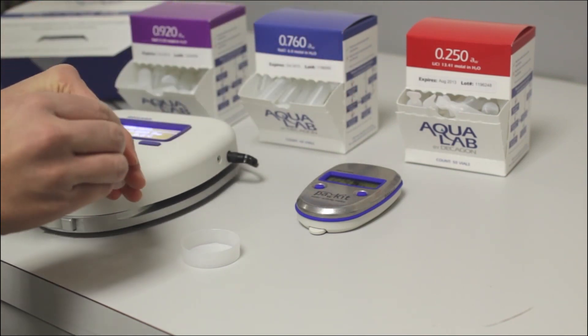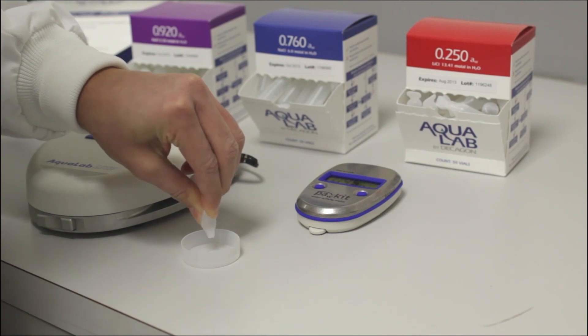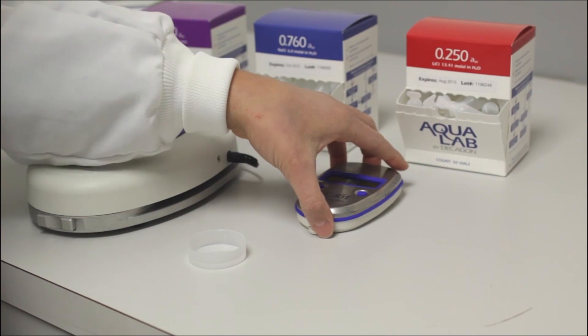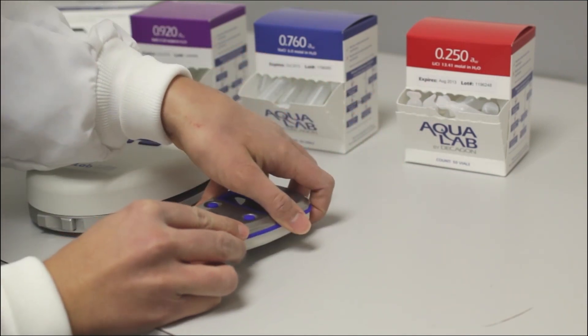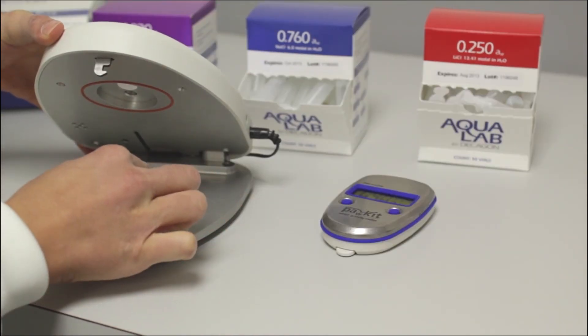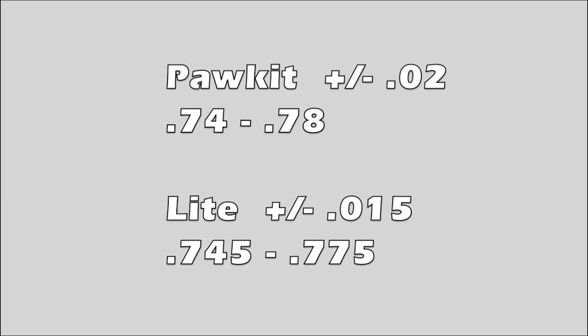You always want to use the .760 standard first, no matter what you are testing. You break open a vial of the .760 and pour it into a sample cup. If you have the Pocket, you place the Pocket over the sample. If you have the Light, you place the sample cup inside the Light. If the .760 standard measures between .74 and .78 in the Pocket, it is measuring within spec and you can move on to the second standard.